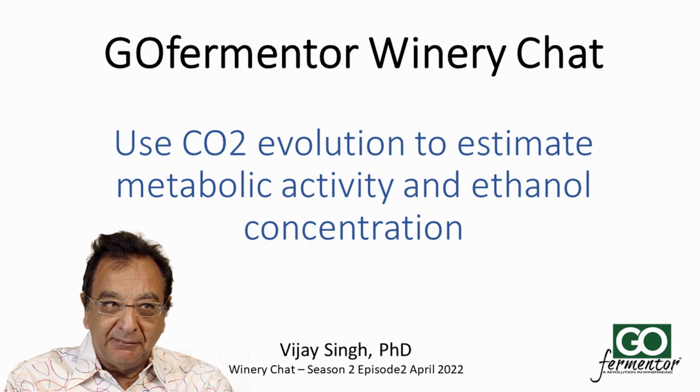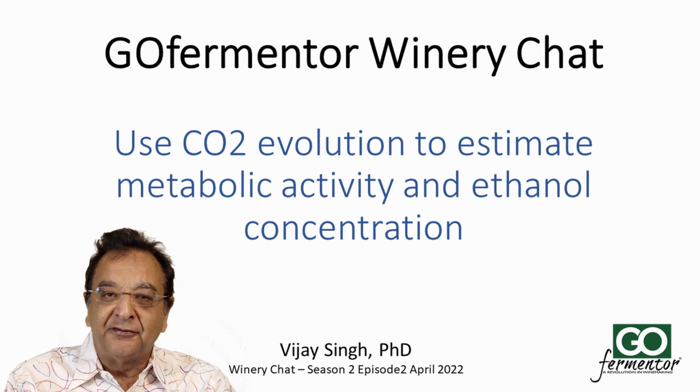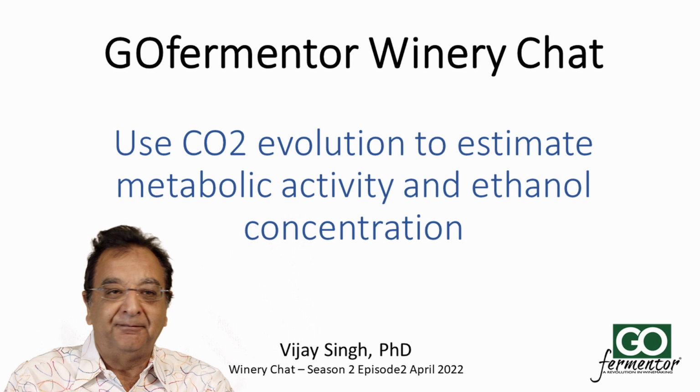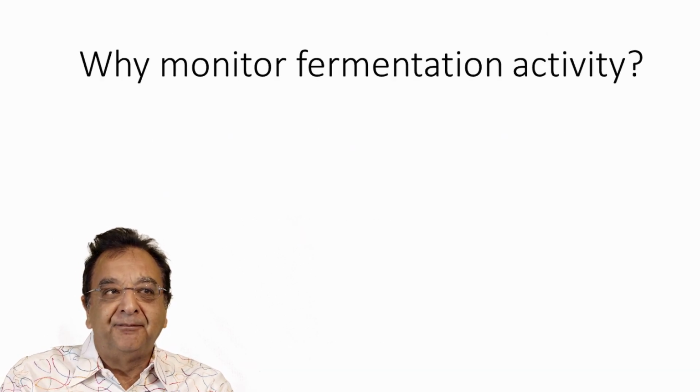Okay, let's go on to our topic for today. We're going to talk about using CO2 evolution from the fermentation to estimate fermentation metabolism and even the ethanol concentration in the fermenter. First of all, why monitor fermentation activity?